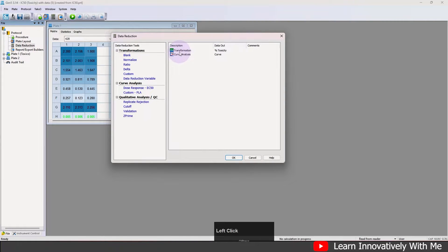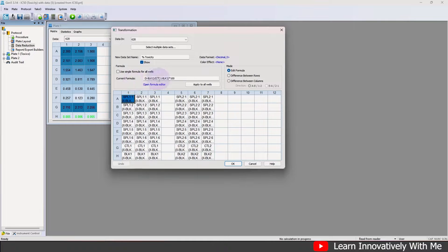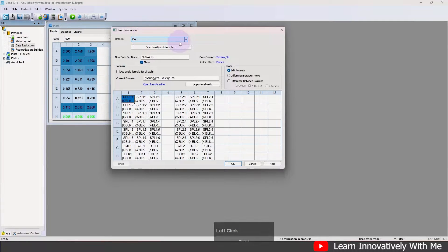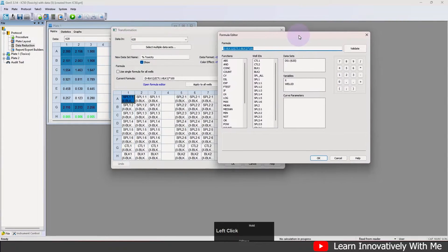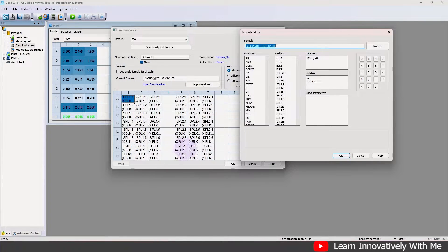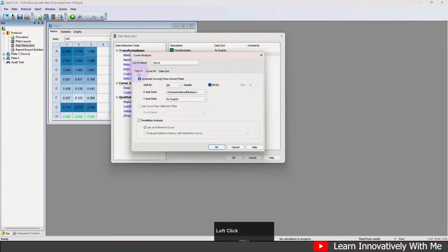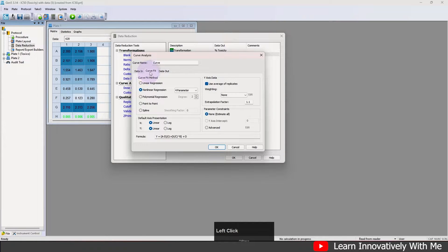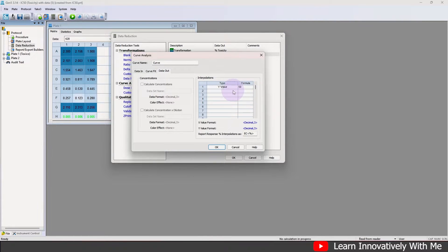In the data reduction there are two things: transformation for percent toxicity, and curve analysis. If you click on transformation, you can see the formula for how percent toxicity was calculated and what data was used — here it is 620nm, but if you are using a reference wavelength you can use the subtracted value. In the formula editor there are more options. For curve analysis, the X-axis is concentration or dilution, the Y-axis is toxicity, and the curve fit is four-parameter nonlinear regression, with data output as Y value at 50 percent.